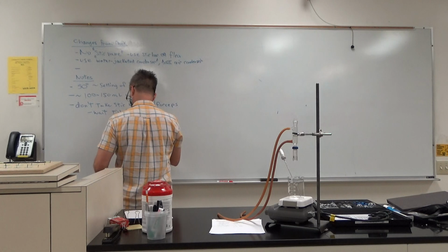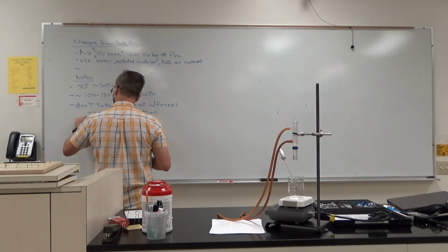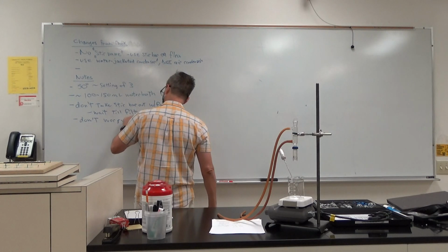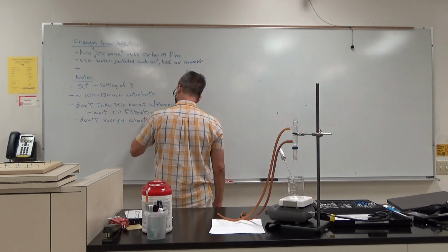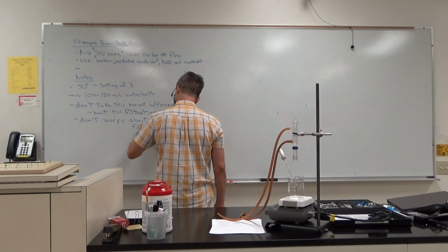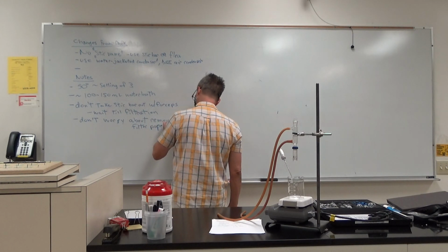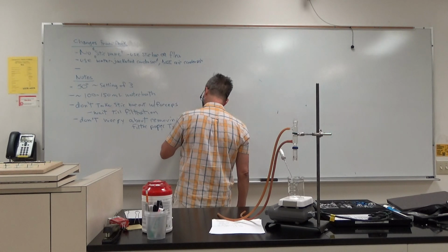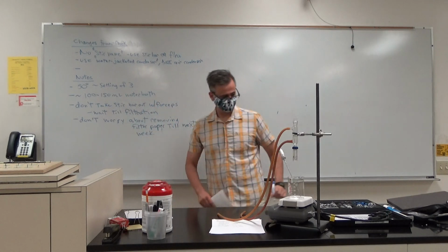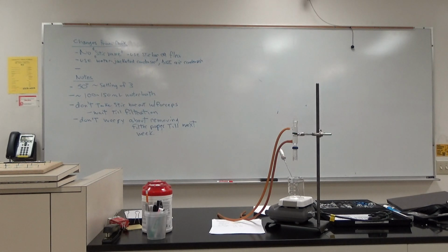Okay. Don't worry about removing the filter paper until next week. Okay? And that's part of the crystallization. So we're purifying this stuff by crystallizing, right?